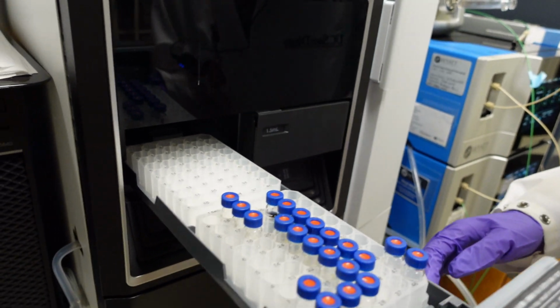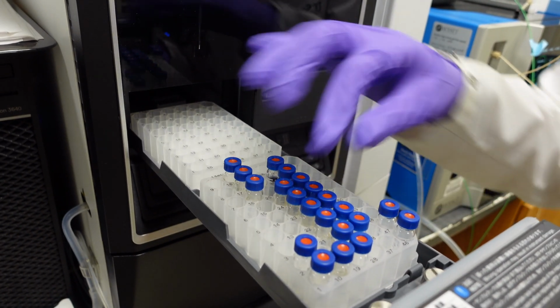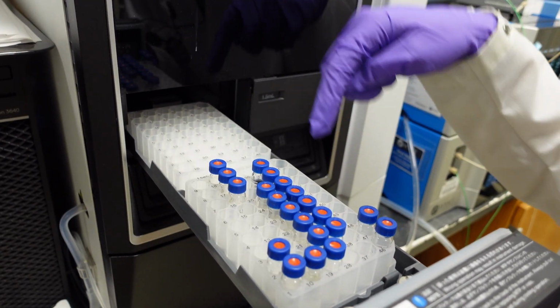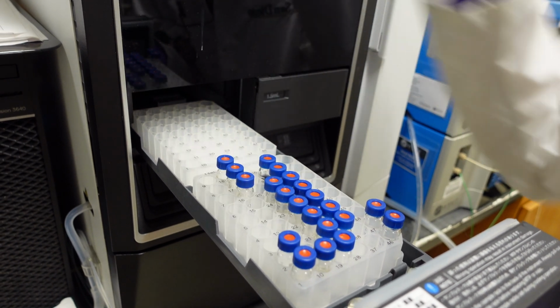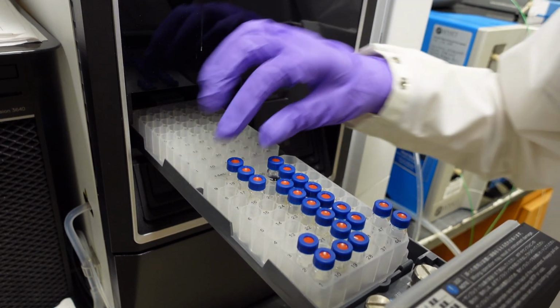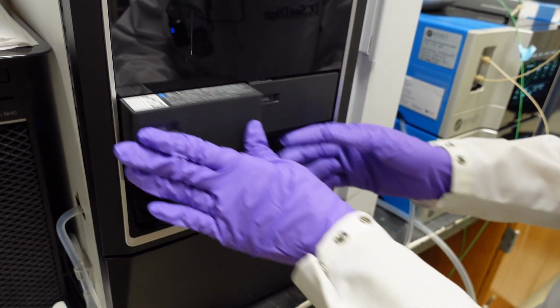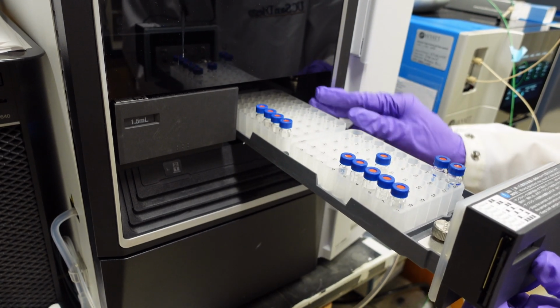Here we have the sample loading, and here's plate 1 and plate 2. We can stick our samples in here, and each one of them is numbered. Since this is plate 1, this is the first one here, it'd be 1 dash, I don't know, this one would be 27, or no, this one would be 18. And then we also have more on this side. This is plate 3, and this is plate 4.